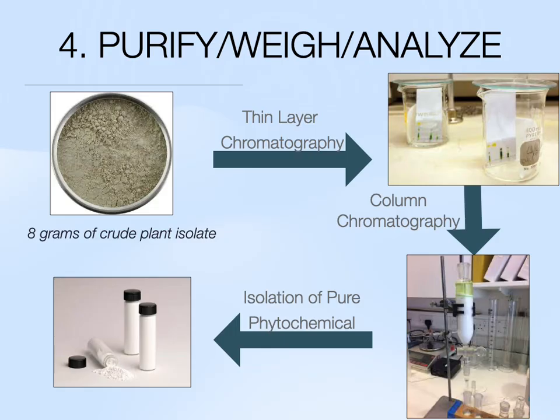Eventually, that solvent is removed, and we get to the picture that's on the lower left corner, which is actually the dried isolate of pure phytochemicals. Now, I have a picture here on this slide which gives you an indication of the summary of steps, but this is by no means as simple as it looks. Many times we have to repeat these steps multiple times over.